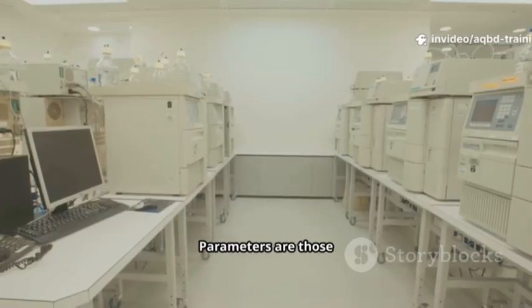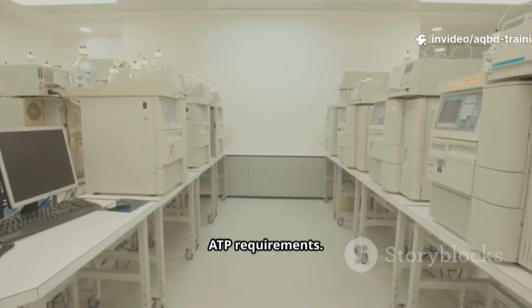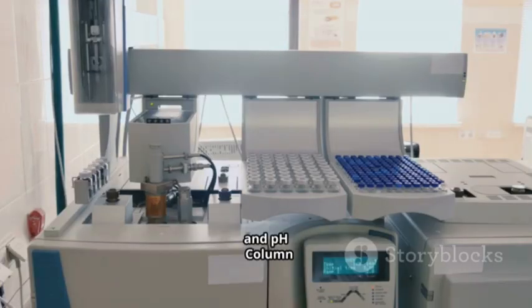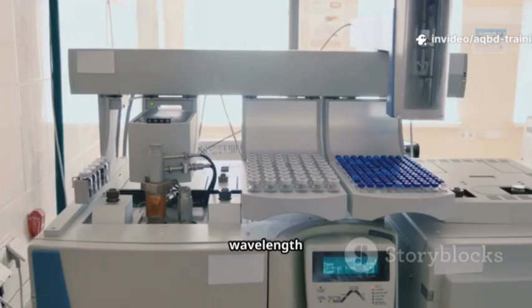Critical method parameters are those method variables that significantly impact the method's ability to meet its ATP requirements. These might include, for HPLC methods, mobile phase composition and pH, column temperature, flow rate, injection volume, detection wavelength.